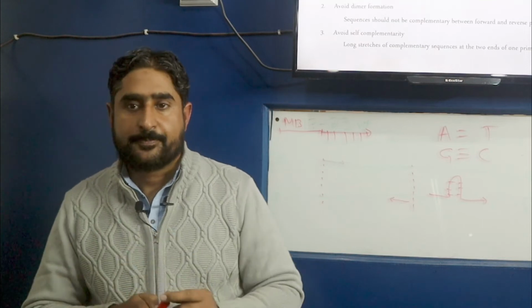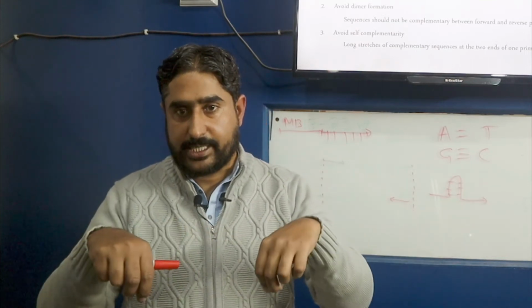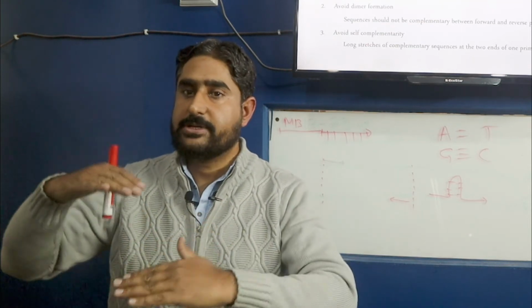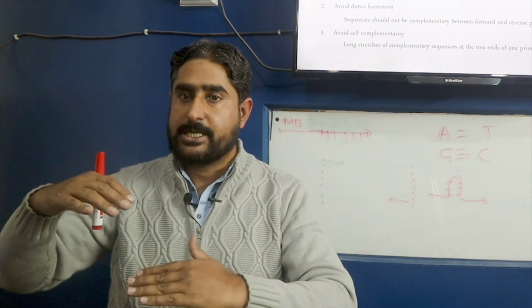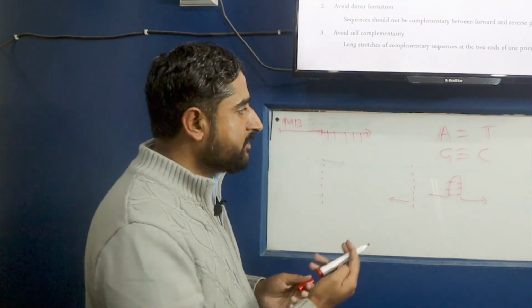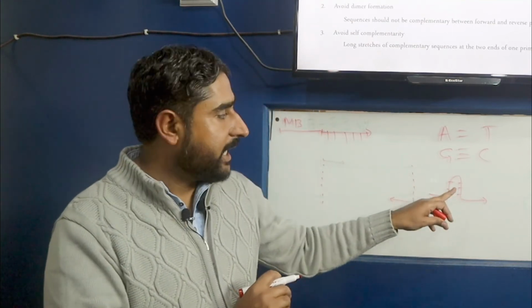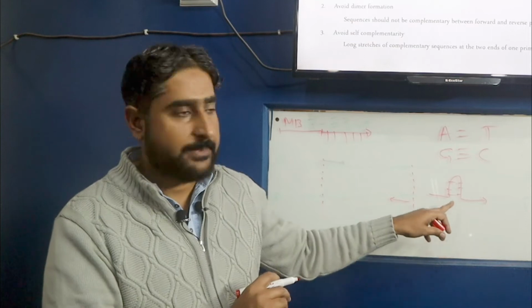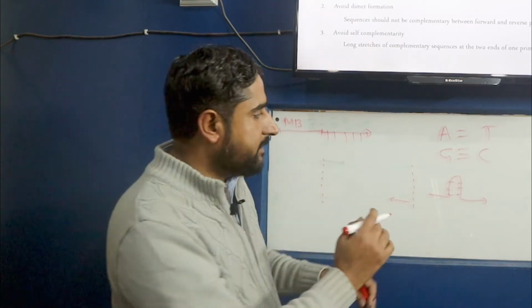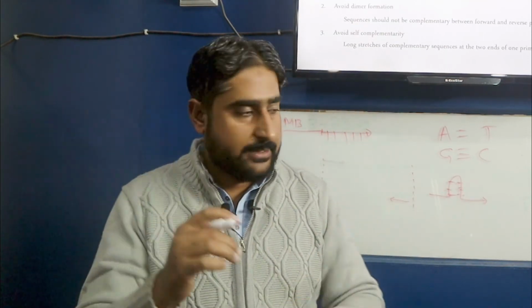So for example, if some nucleotides within one primer are complementary to other nucleotides, but the overall annealing temperature of the primer is sufficiently higher, then we are again opening that hairpin formation. If the hairpin formation is due to only 3 bases, then if we elevate the temperature to a certain extent, these complementary bases will be in open conformation, like this.